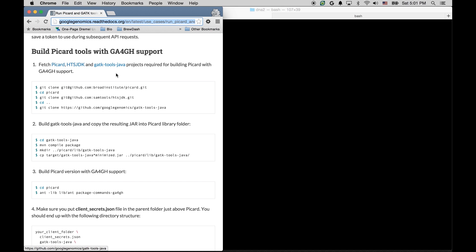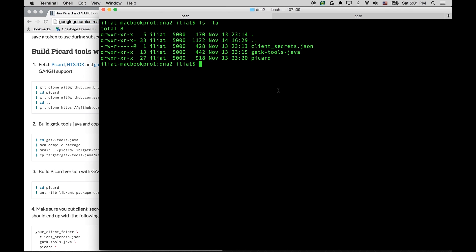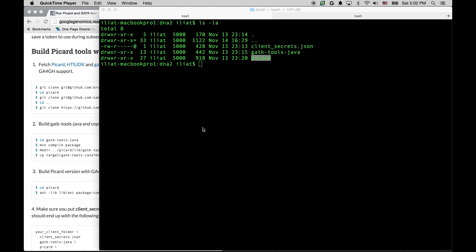At the end of the process, we should have the following files in our working folder. Let's list them. First of all, client-secrets.json file that we got when we authenticated. And then Picard tools themselves that we have built with GA4GH support.